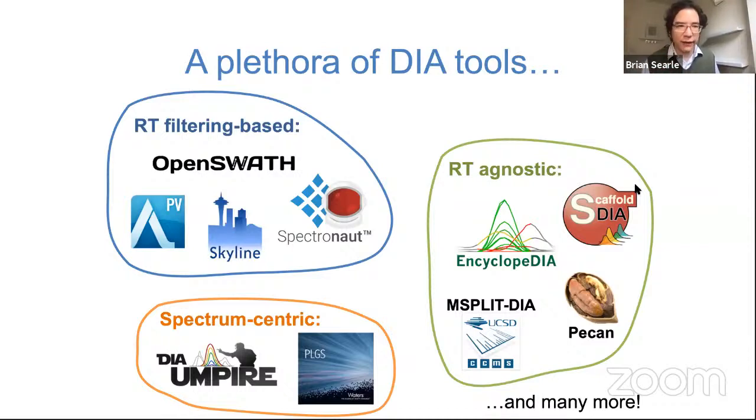So there are lots of different ways in which you can work with this, but they fall into these different brackets, and they all have different good and bad aspects to them. Again, the spectrum-centric ones all require precursors.